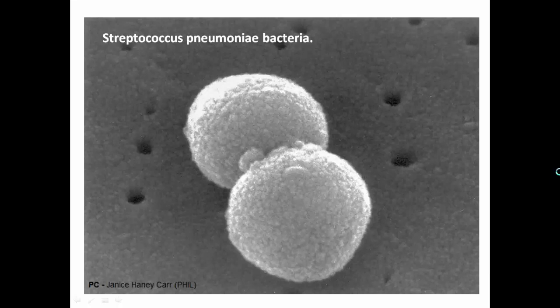In this video, I'll be showing you electron microscopic images of some of the fascinating microbes you might be interested in looking at — how they look under the electron microscope. It's just so amazing. Let's start.